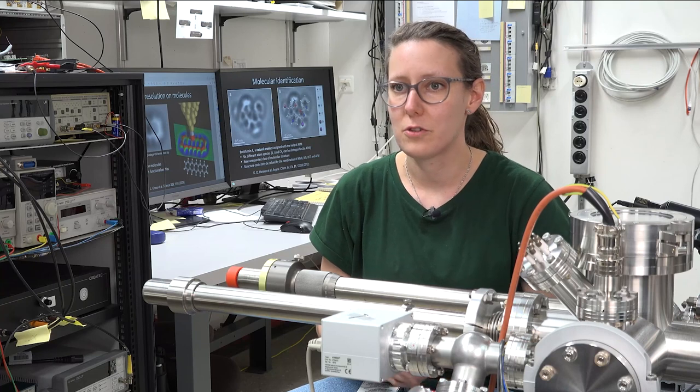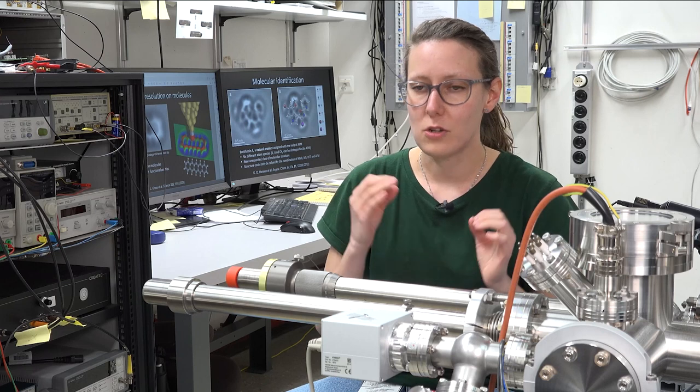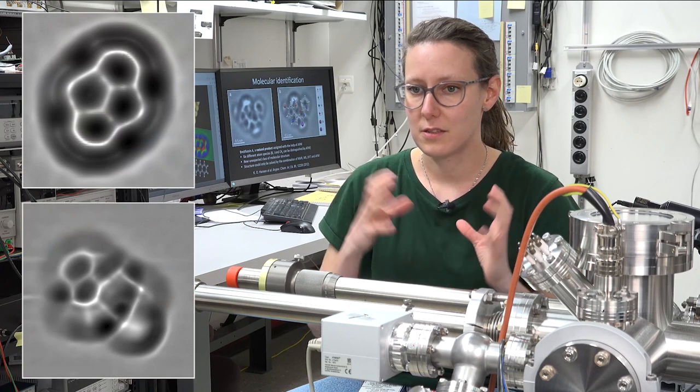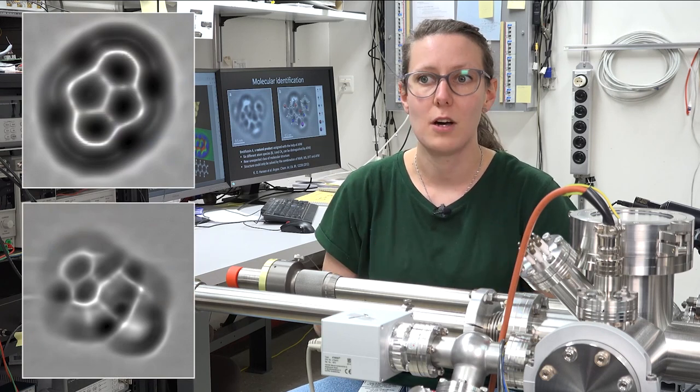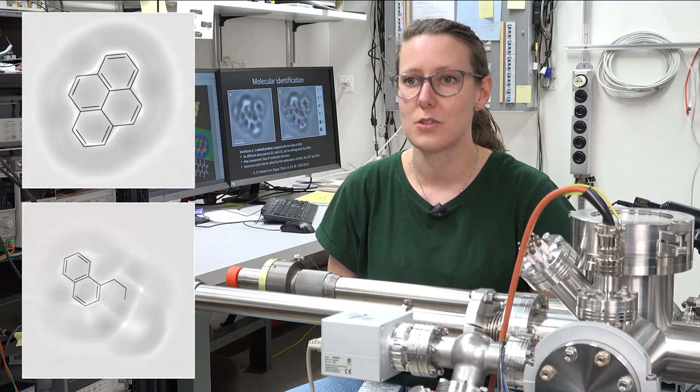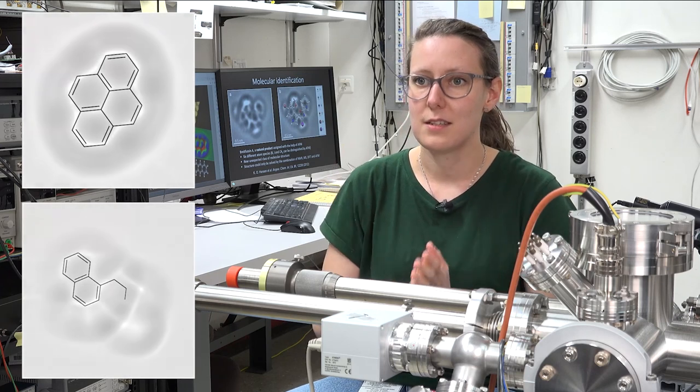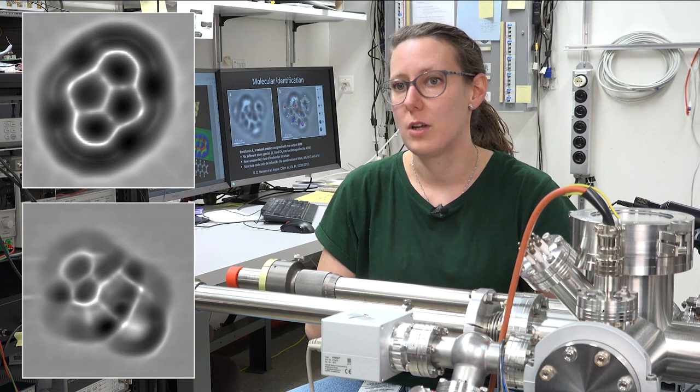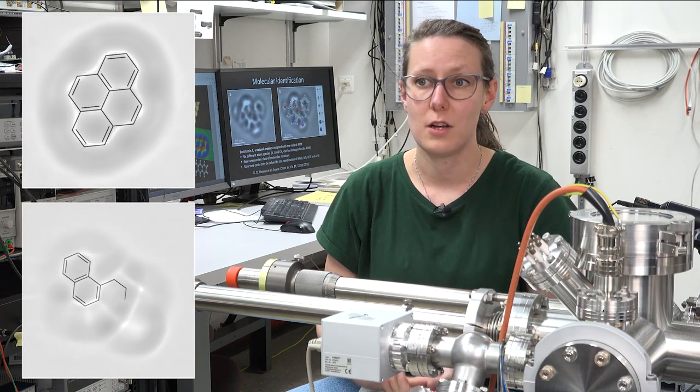One of the core strengths of atomic force microscopy is, first of all, its single molecule sensitivity. So we can really have a look at single molecules from specific samples. And also, with AFM, we can really atomically resolve the spatial structure of single molecules. So that is one means to get real space images with sub-molecular resolution of single molecules.